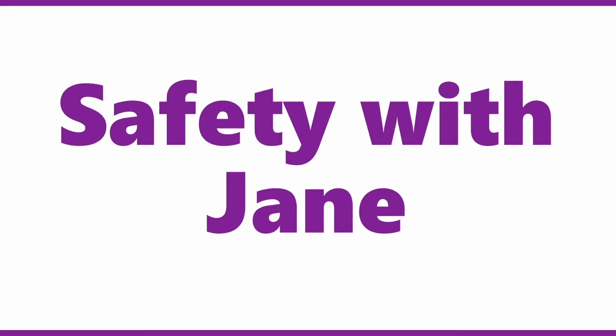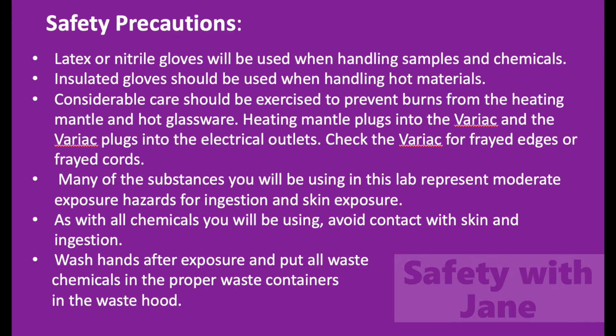And now, safety with Jane. Latex or nitrile gloves will be used when handling samples and chemicals. Insulated gloves should be used when handling hot materials. Considerable care should be exercised to prevent burns from the heating mantle and hot glassware. The heating mantle plugs into the variac and the variac plugs into the electrical outlets. Check the variac for frayed edges or frayed cords.